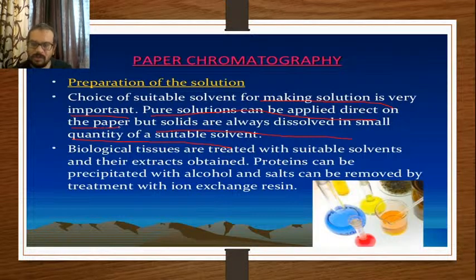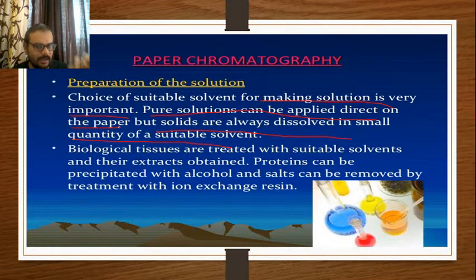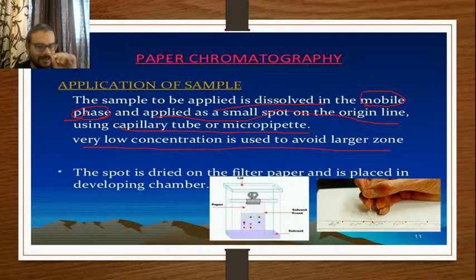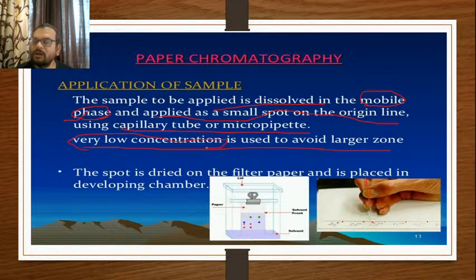If your compound of choice which you are going to resolve through chromatography is already available in the form of a solution, you can easily apply it on the filter paper. But the basis of effective resolution is that you need a very low concentration of your solution or sample for a better resolution, to avoid the larger zones.